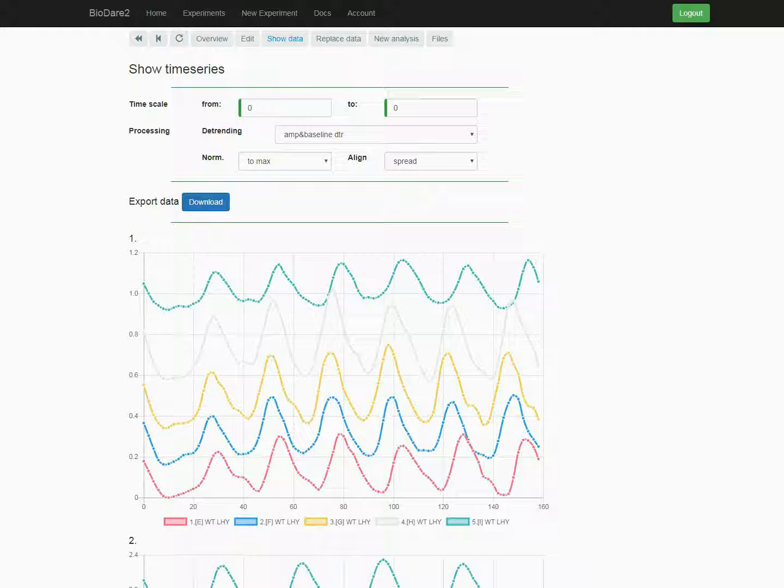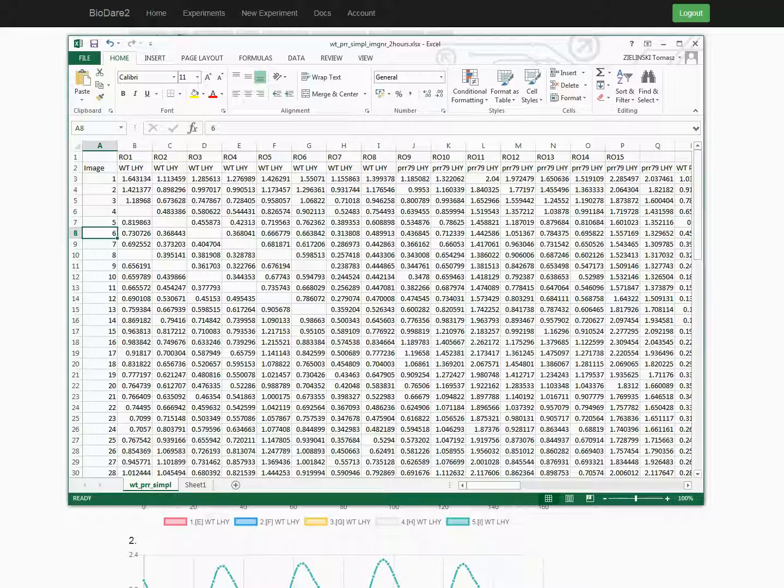I should probably mention the typical problems of data import. One is caused by gaps in the time column. Having gaps in the data values is allowed, like in this file. It is perfectly normal, as some values could be deleted to remove the spikes in the data, or maybe each trace was recorded at different times. That is fine. But you cannot have gaps in the time column.